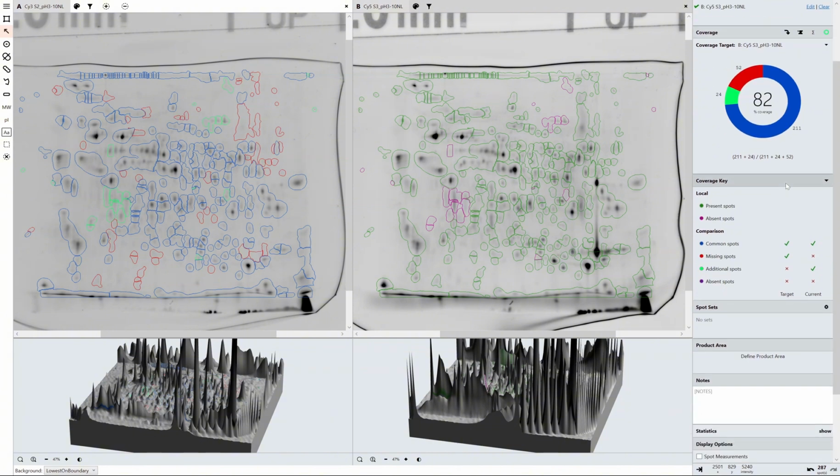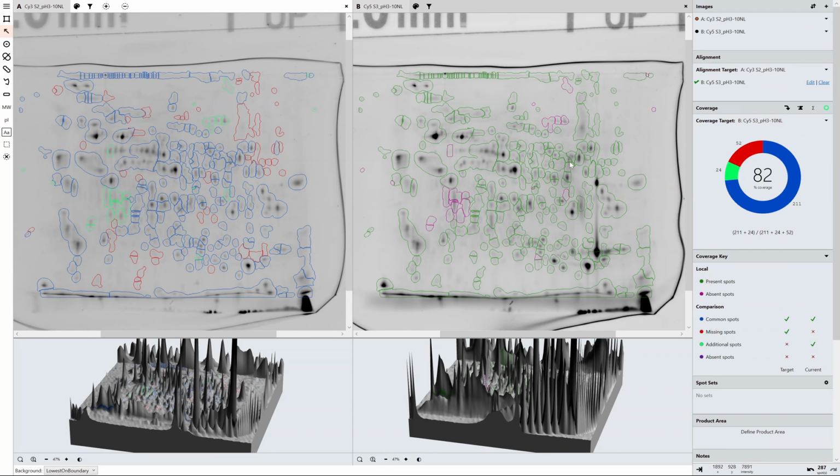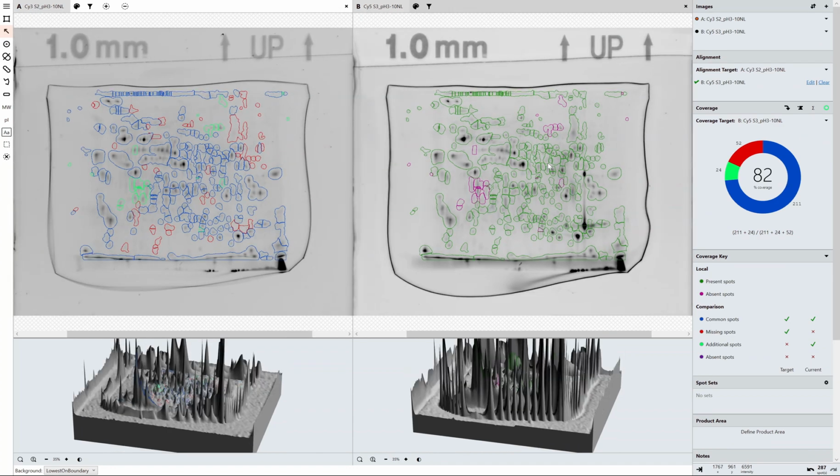This is a whistle-stop tour of how to use 2D techniques to get an antibody coverage that you would then use to validate your ELISA or whatever you're going to use your antibody in, and then also for regulatory submission to the FDA to prove your antibody coverage. It's still the gold standard to use 2D techniques at the minute for determining host cell protein coverage.